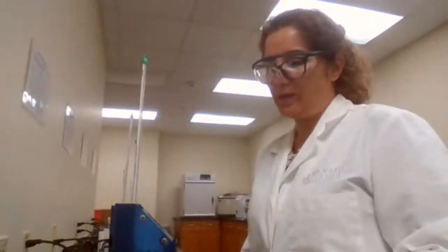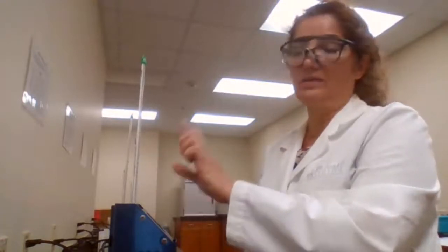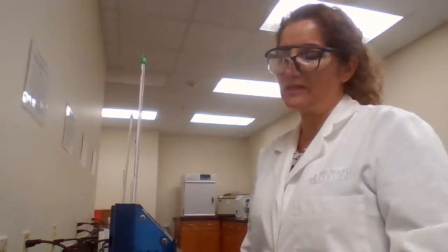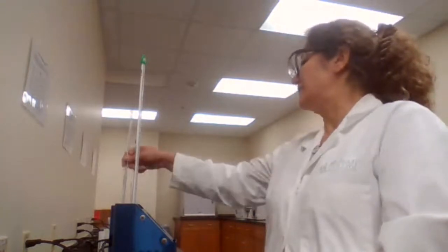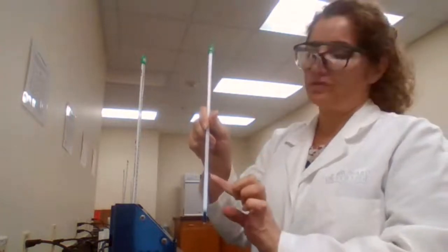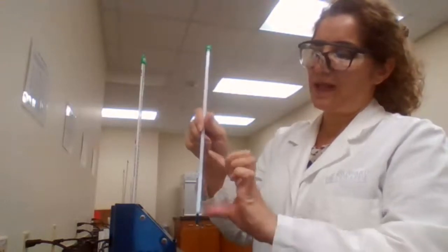Sometimes we cannot expect the exact number of 113 to 114 unless we are 100% sure that our thermometer is calibrated. Sometimes the thermometers are not calibrated, maybe a couple degrees off. We try to start with a thermometer that is working. You should check the thermometer: sometimes you see a gap in the ink, and then you want to make sure not to use that thermometer. Use a thermometer that doesn't have any gap.